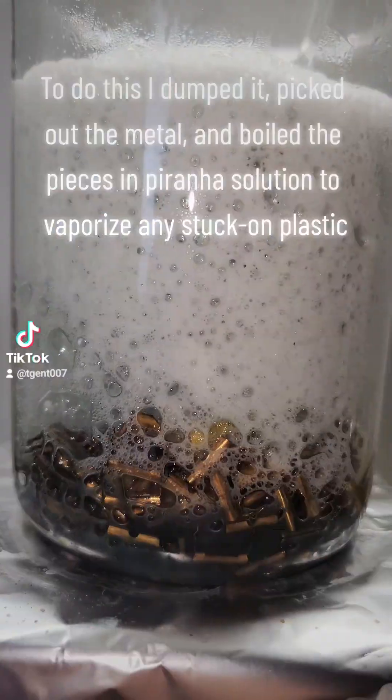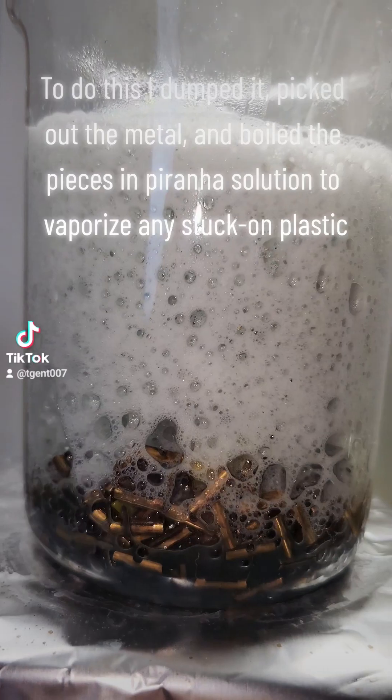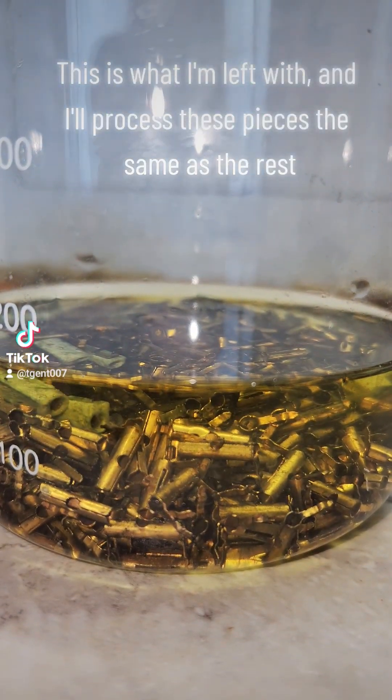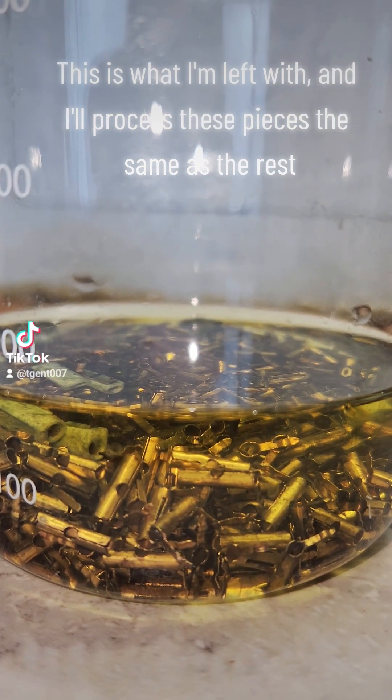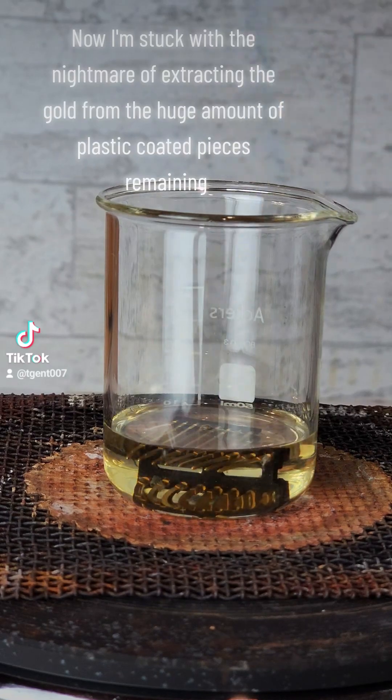To do this, I dumped it, picked out the metal, and boiled the pieces in piranha solution to vaporize any stuck-on plastic. This is what I'm left with, and I'll process these pieces the same as the rest.